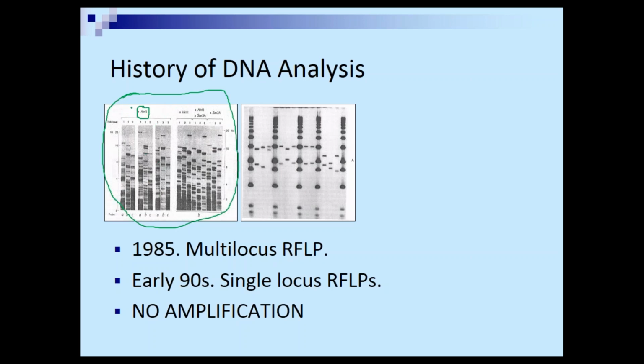We want HINF1, we want the number 1, and we want probe B down here. So we're actually looking at that second column there. And it should match HINF1, number 1 here, and probe B down here. So it should match that first column.